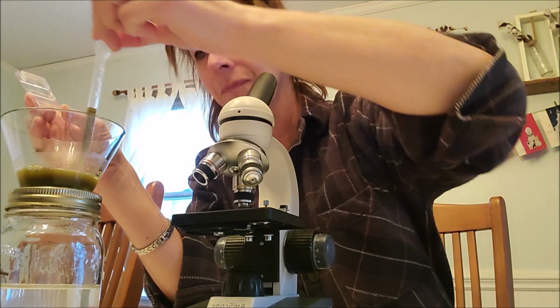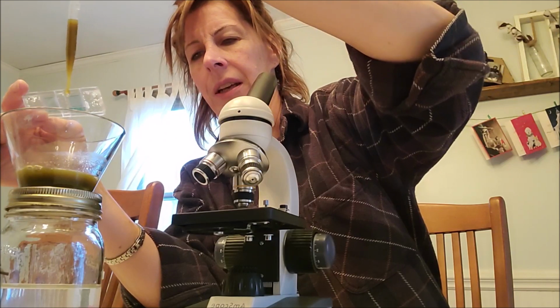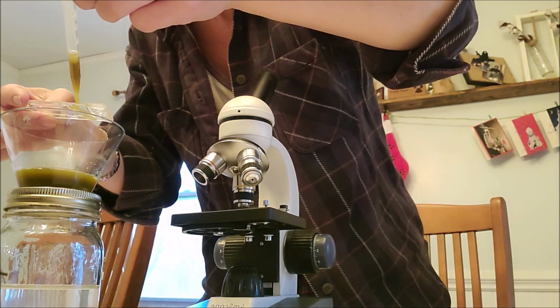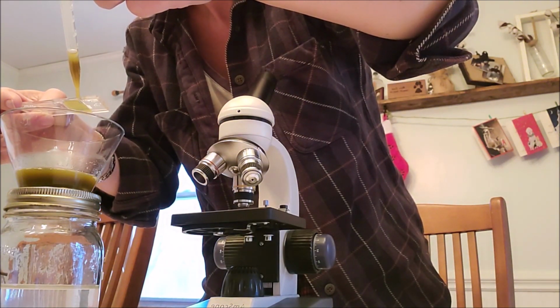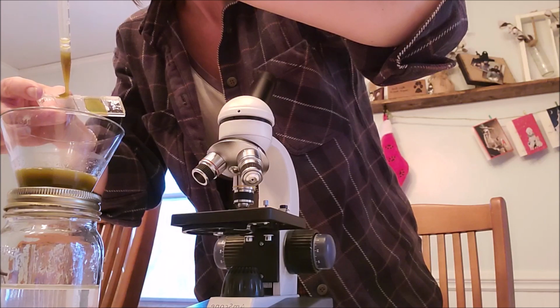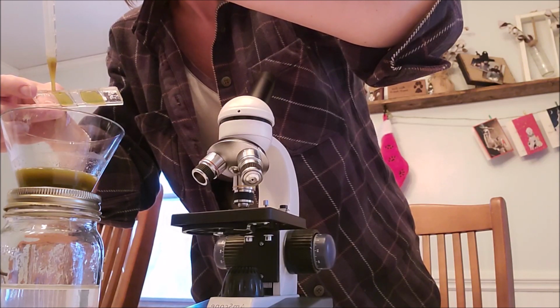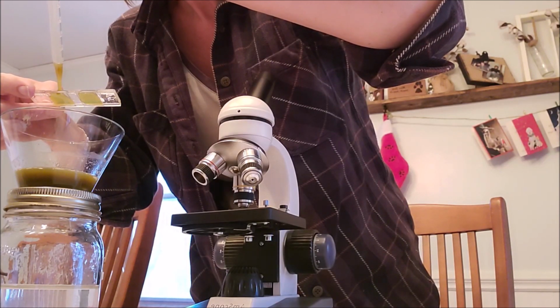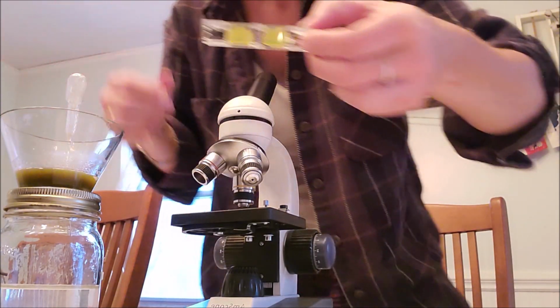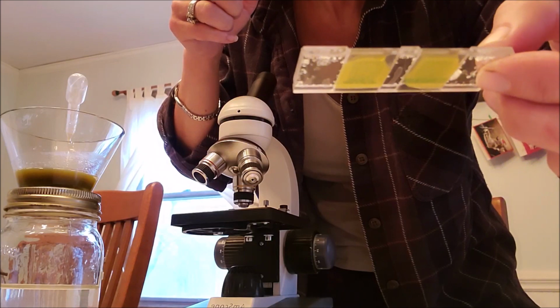And we'll suck some of this up and we'll put it right in here. I don't know if you guys will be able to see it, but I gotta do it this way so I don't get air bubbles. If it doesn't drip out the front, hold on. There. And then we'll put some in here. There we go. There. Put that up here. Now, as you can see, I'm not going to tilt it because it'll dump it. So you can see it's all filled up and all the grid lines are all full.